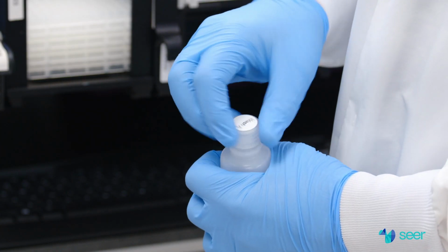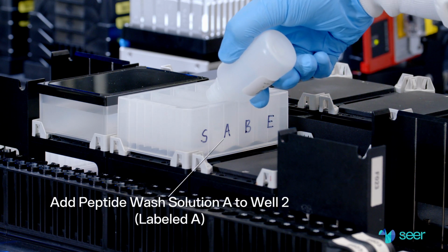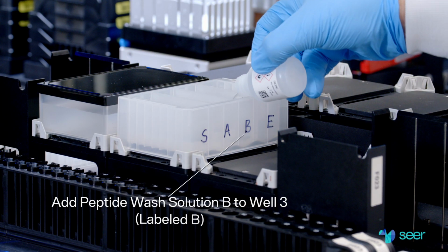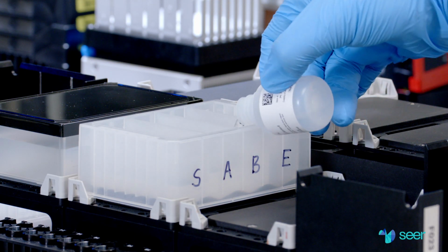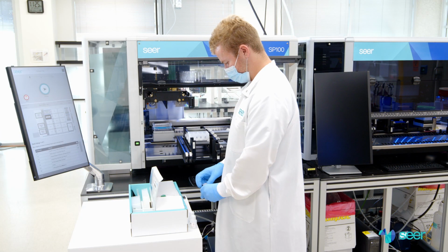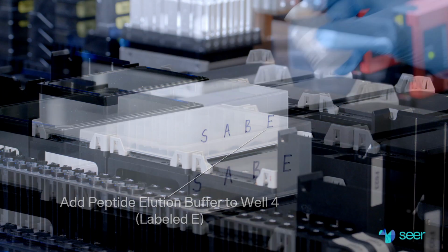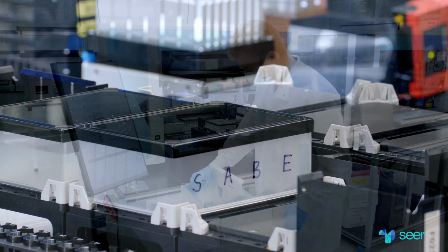Pour 1 bottle of peptide wash solution A into well 2, labeled A. Pour 2 bottles of peptide wash solution B into well 3, labeled B. Ensure that wash solution B does not splash into neighboring wells during loading. Pour 1 bottle of peptide elution buffer into well 4, labeled E. Cover the cleanup reagents 4-well reservoir with a black plate lid.